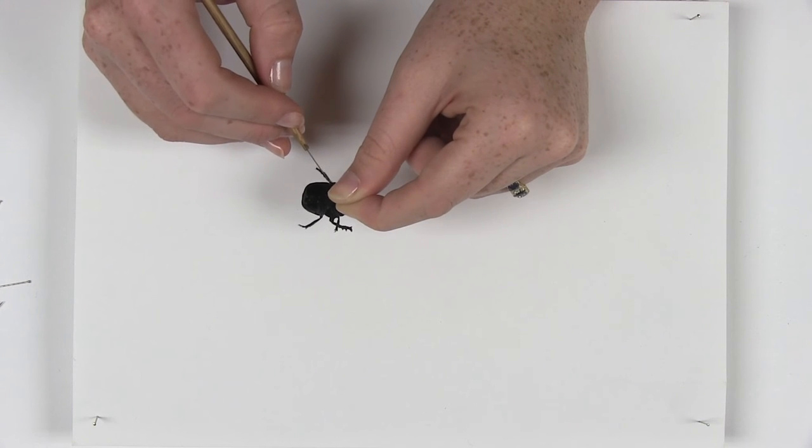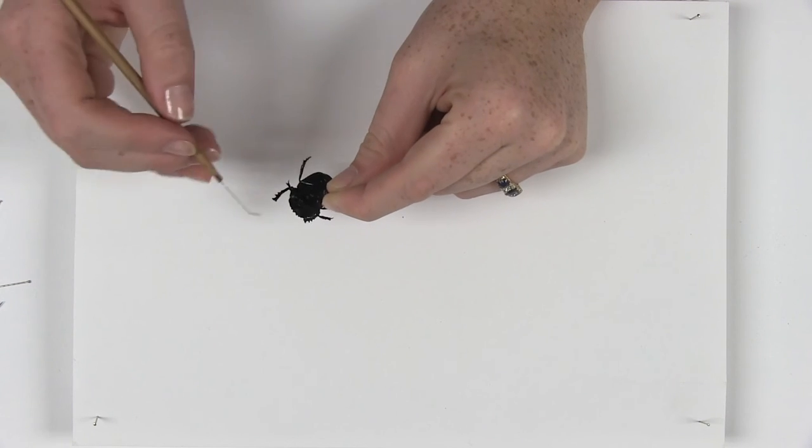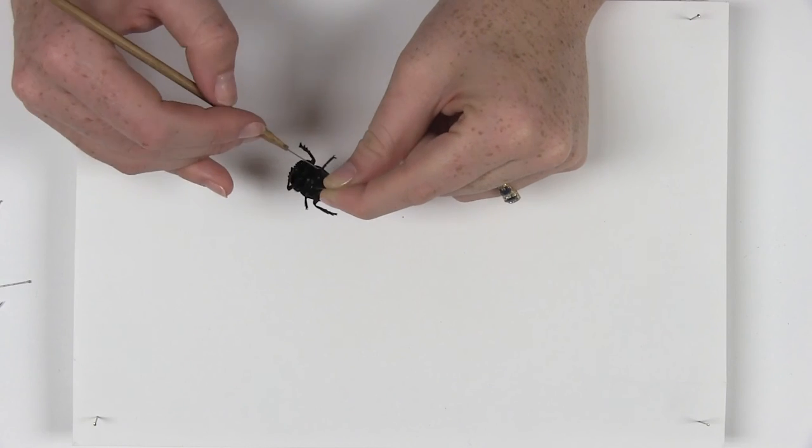Please note that the legs should move easily like this, so either use a fresh insect or one that has been in a relaxing box.